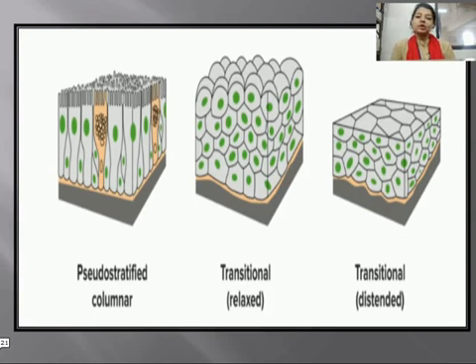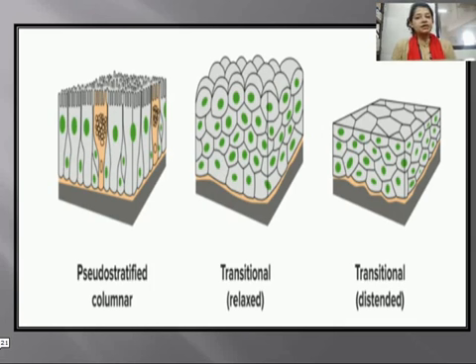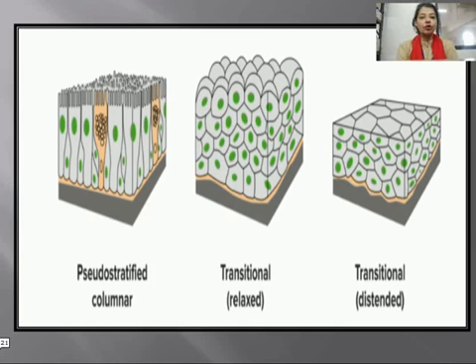An important characteristic of pseudo-stratified columnar epithelial tissue is that all cells touch the basal membrane, but not all of them reach the free surface. Cells that reach the free surface are columnar type; those that do not rest on the basal lamina and have a round nucleus.